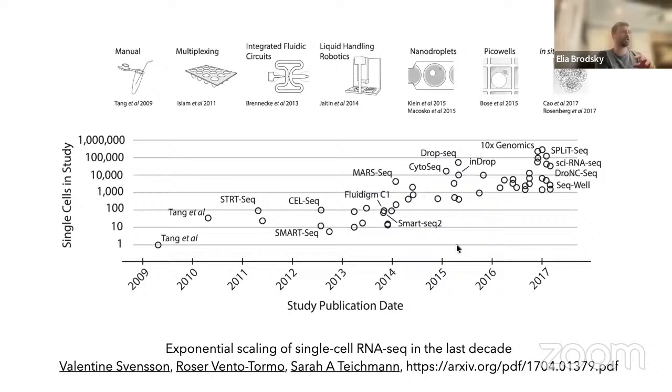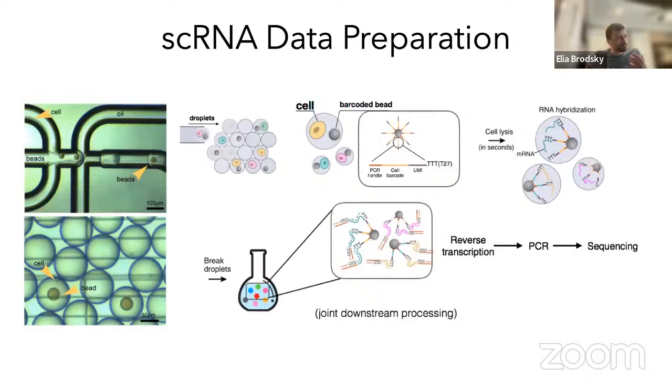So to really appreciate the different approaches that have been more or less established over the past decade or so, maybe a couple of decades now, let's take a look at some of these basic ideas and technologies and try to understand how we capture this precision and this dimension of single cell. So one of the first ideas is to differentiate between cells, right?